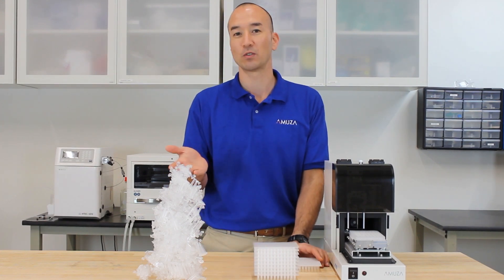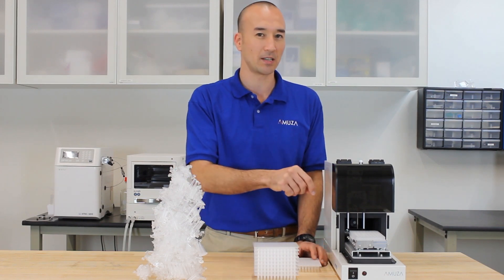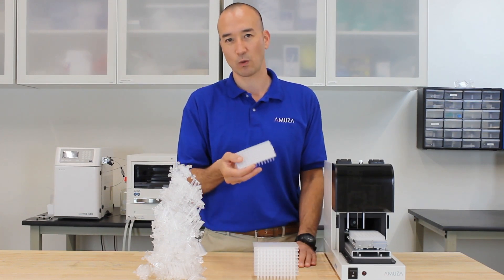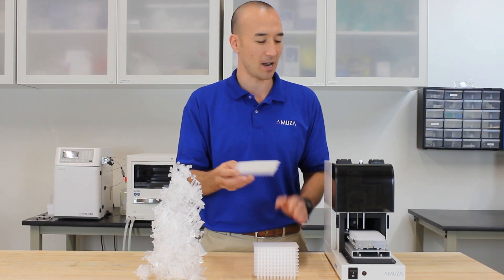First off, with individual vials, you have to take each one, label it, and make sure it's placed in the same place. It can lead to a lot of confusion, not to mention being a lot of work. With 96-well plates, as I mentioned, it's all in one piece, it's all pre-labeled — everything is done.